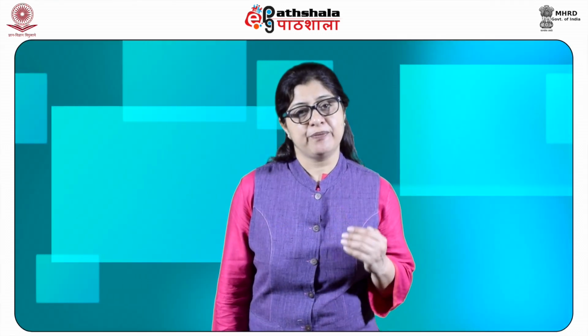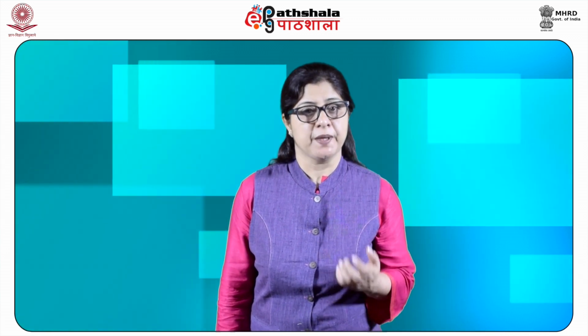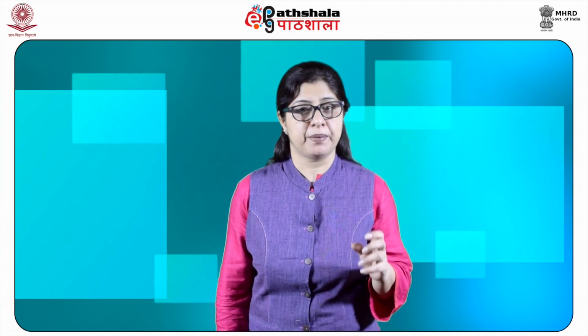If the active polyvalent ion in the resin is to be exchanged with an ion of lower valency, the exchange has been found to be favorable by using a much higher concentration of the solution. The quality of an ion exchange resin is determined by its capacity, which in turn depends upon the total number of ion active groups per unit weight of the material.